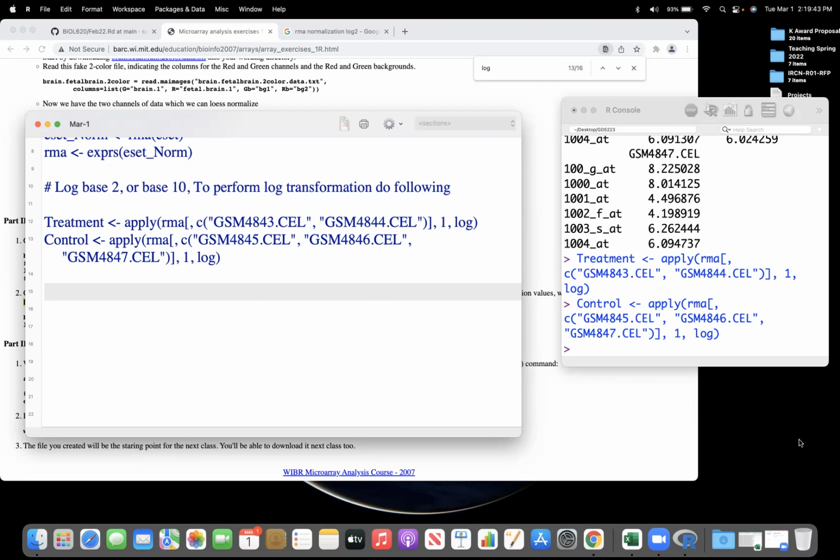Yeah, you see? Unnecessary spaces. Yeah, this is better.